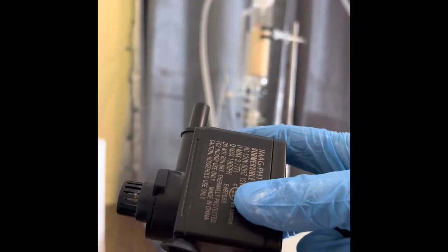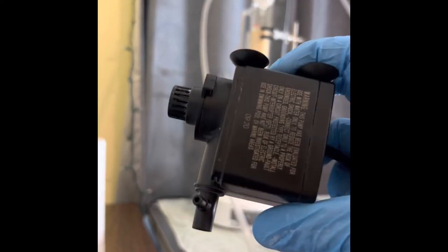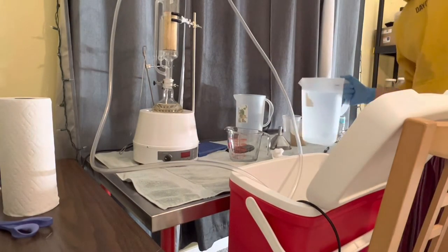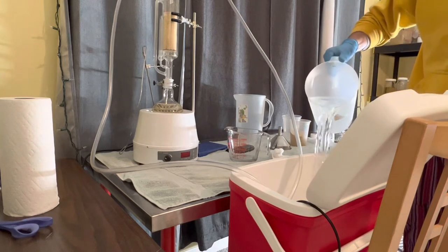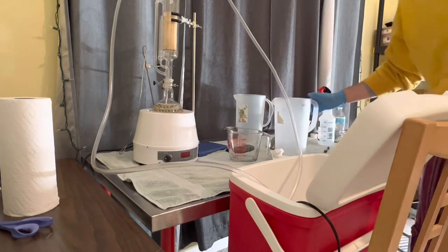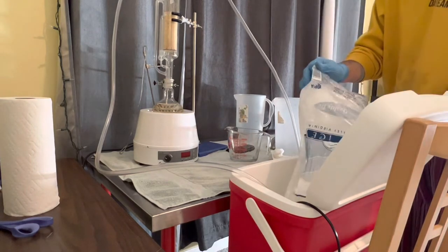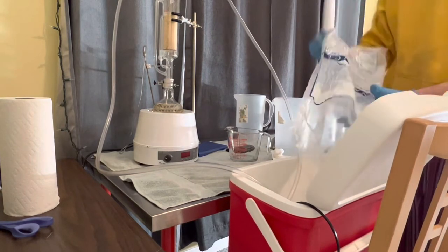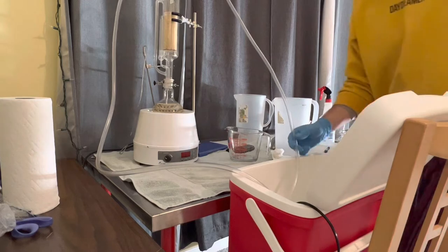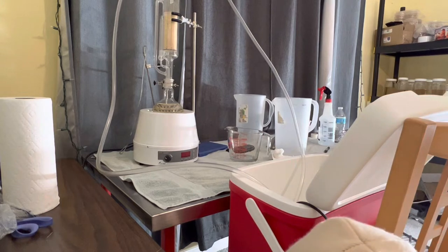So now this here is just a little water pump for an aquarium. You want to make sure that you get the right size. Gotta make it an ice water, really icy. She likes it cold, eh? All right, so we've got that hooked up.